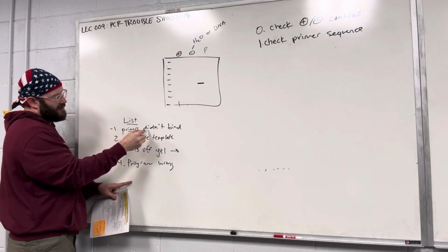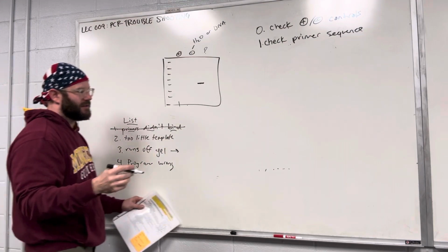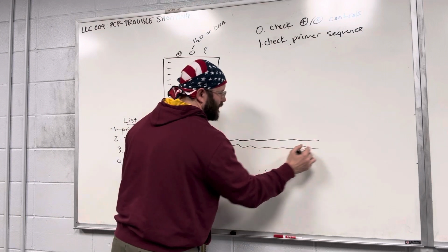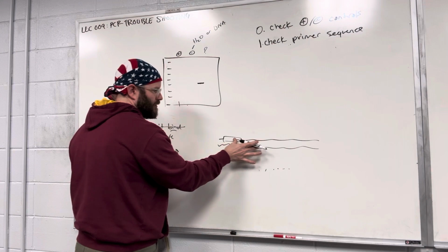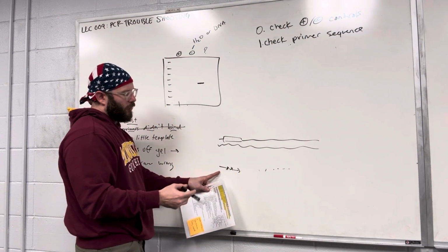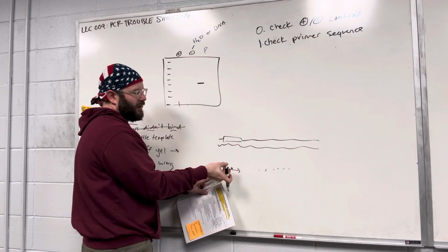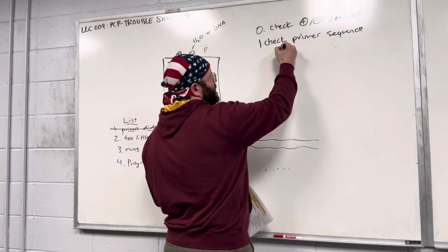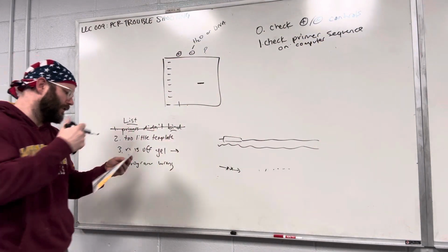So if a primer doesn't bind, usually the biggest mistake is just when you design these primers, you're looking at some sequence of DNA on the computer, it's a text file, and you're picking out some primer, and usually you just make a mistake. Maybe you type out something and there's some mistakes. Or maybe you forgot to flip a primer in the right orientation. Okay, that's a very, very common mistake. So check your primer sequence on the computer. That's a very quick thing you can do.